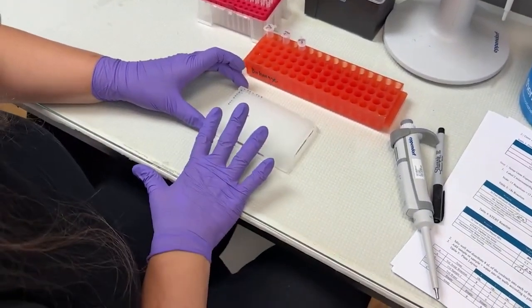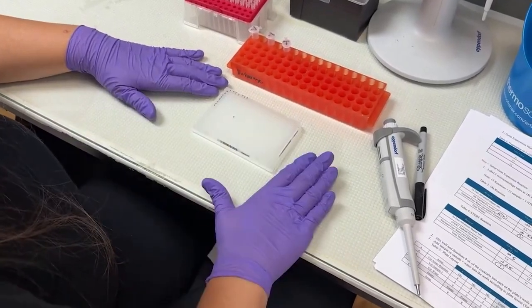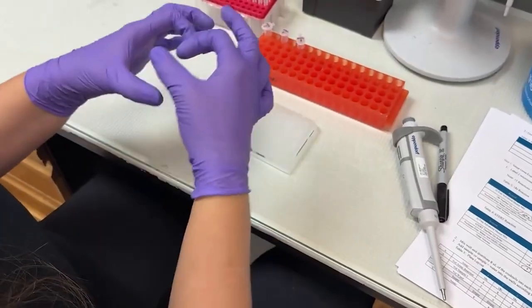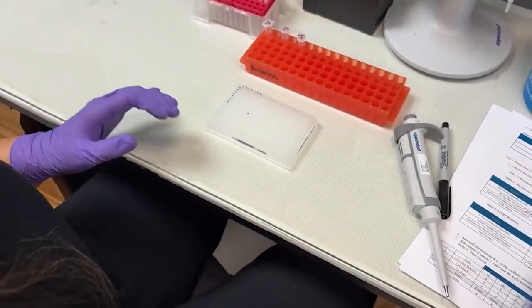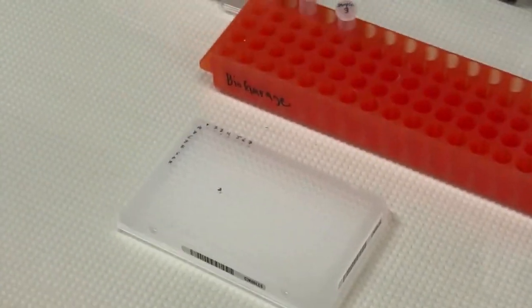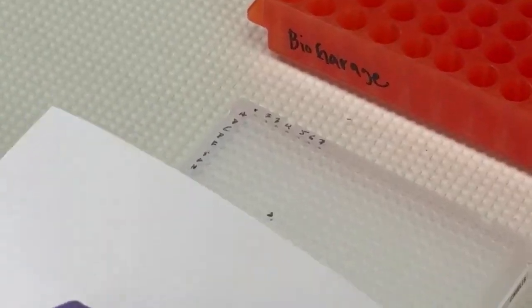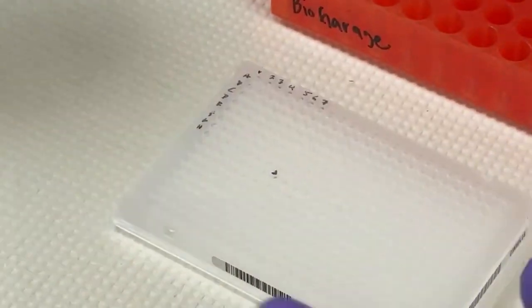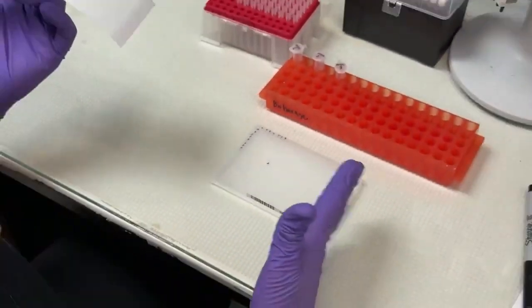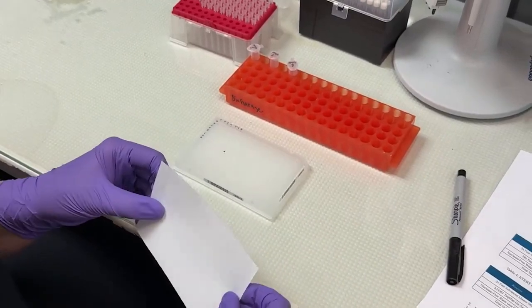I did write on the top of the plate so we could track what was being added. Don't write on the surface. Remember, we're going to image right through the top of those openings that we just pipetted into. So you don't want any marker there. Marker fluoresces. I know, the things you learn. All right, but we do need to seal this because we only have 10 microliters in each of these locations. So we do need to seal it.